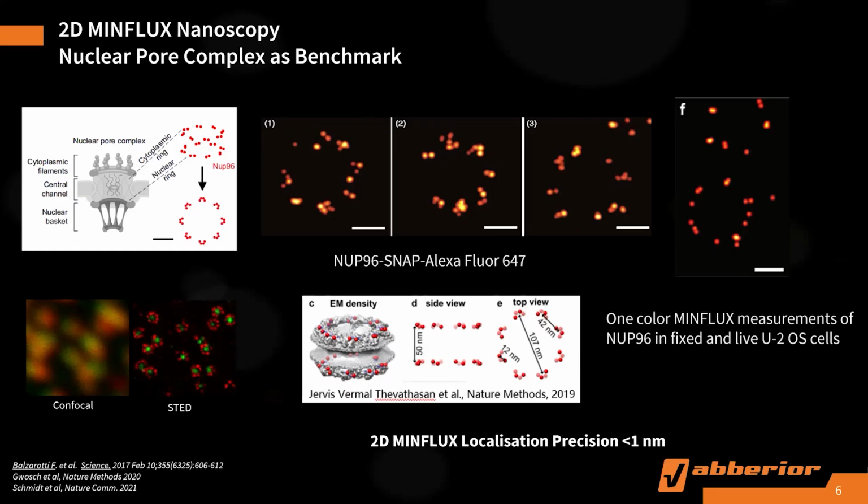However, with MINFLUX, which is an optical microscopy, we can do the same thing, as you can see on this screen. We have a very similar localization distribution of those molecules, right? If you measure the distance, we can get similar data as electron microscopy. In addition, sample preparation in electron microscopy is kind of lousy. It's a dead sample, very complicated, right? You lose a lot of biocharacters during the sample preparation, while in MINFLUX, you can preserve all those biocharacters.